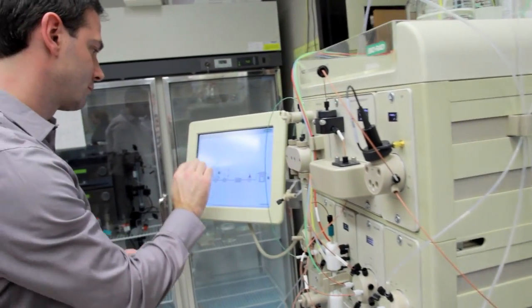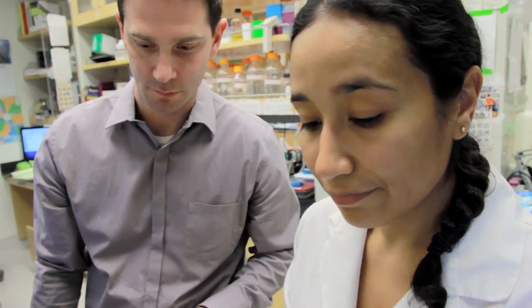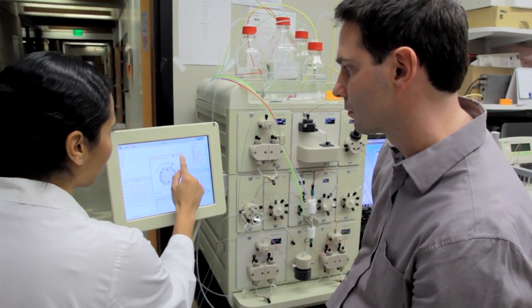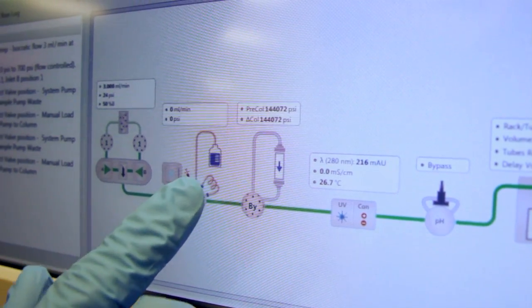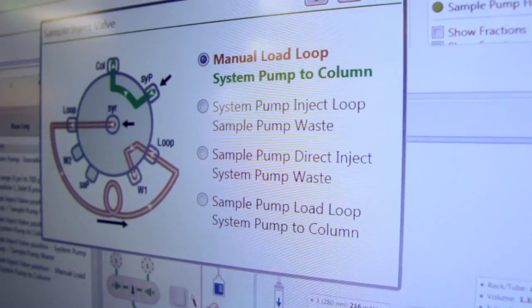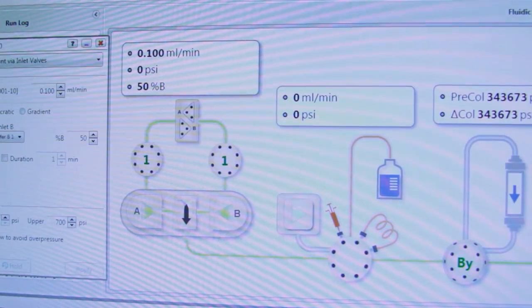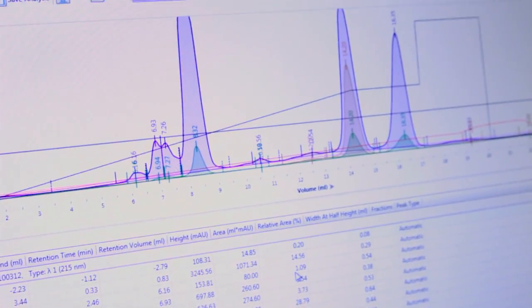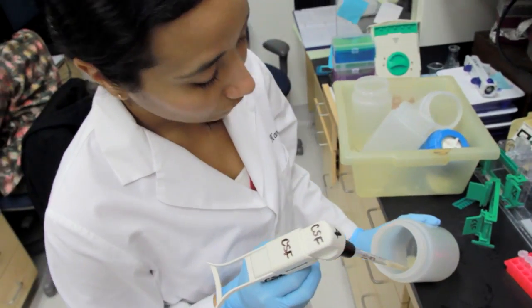The software is very easy to use and intuitive, and that easily allows you to follow how well you're doing with your purification scheme at any point in time. How clean is my protein and how much of it is there?